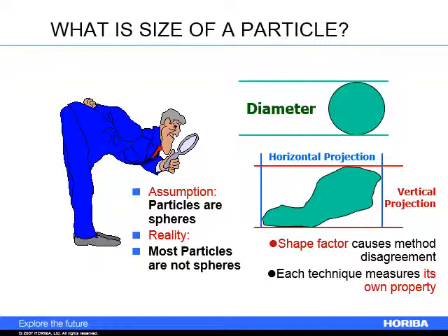You can easily measure something if you consider one thing like a diameter, but you're also looking at something that seems two-dimensional but really is three. So a lot of particle size works off the assumption that particles are spheres, when in reality most particles are not. We do this because of math, to simplify some of the techniques and to give us consistent measurements. But we do need to understand that whichever way you look at the data, you should back it with actual microscopy if you believe your particles are not round.